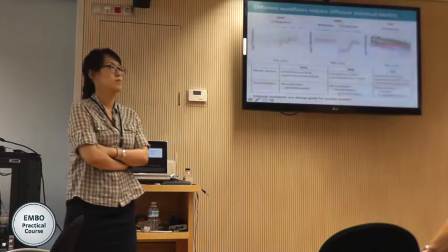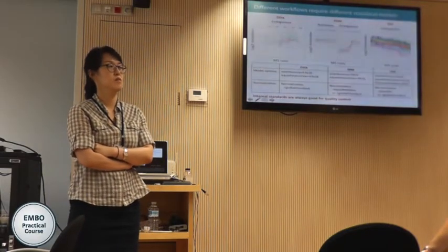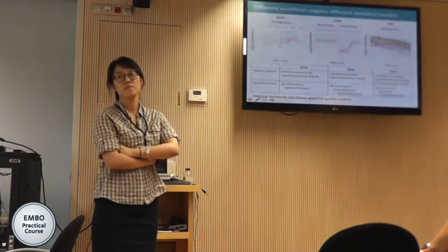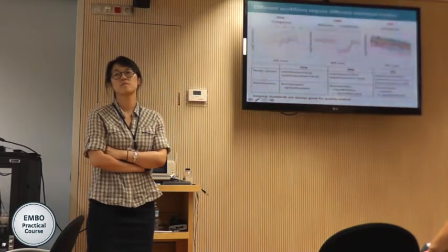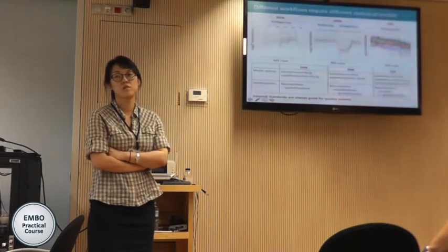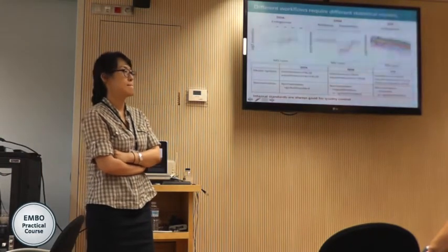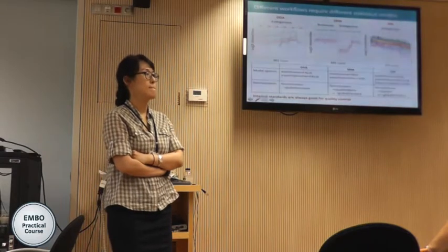But then you're right that if you use the global standard, and the standard itself is not very reliable, then you introduce more noise with the standard. We have just seen that if you really just work with a single global standard, like a single peptide spike-in or a single protein spike-in, depending on where in the chromatogram it elutes, you can sometimes introduce errors. So ideally, one should use several global standards. We had some work where we have a combination of labeled references for some peptides and no references for other peptides, and you can combine this information.